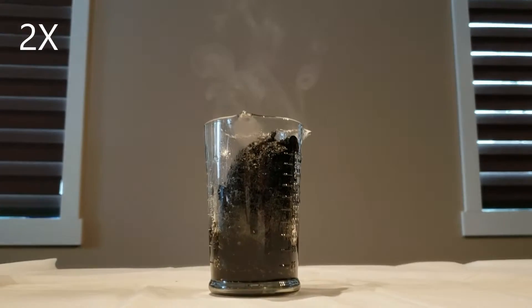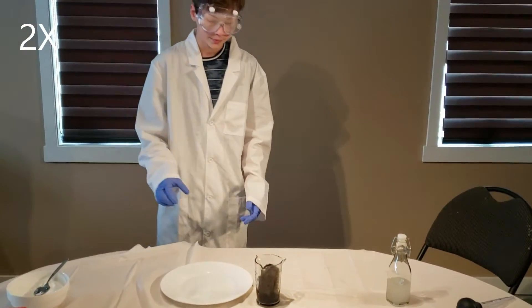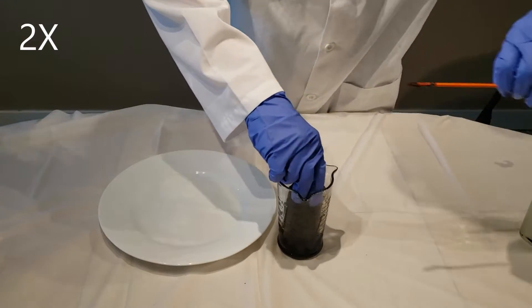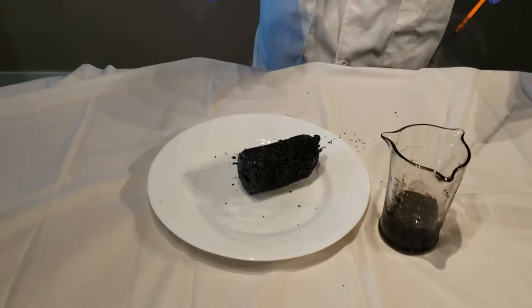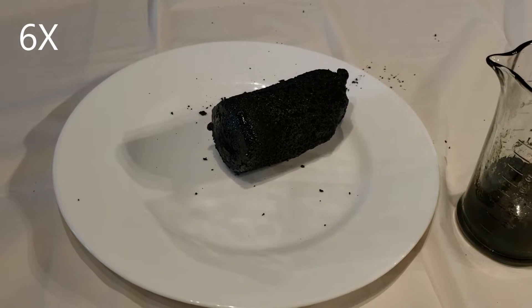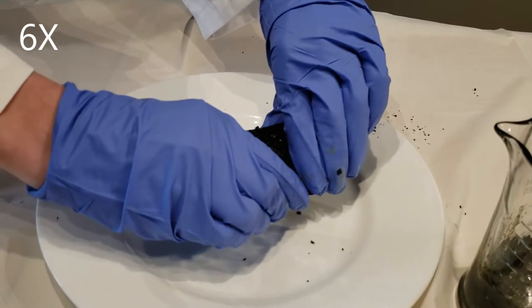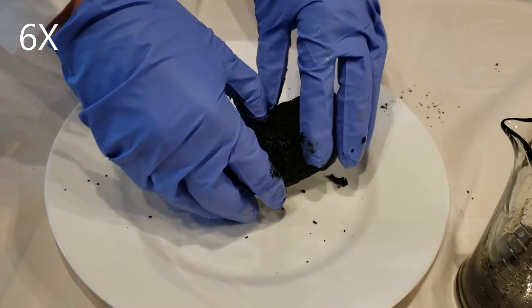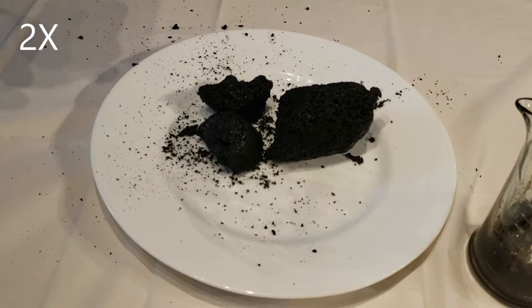I will also show you the texture of the sugar once I am done with it. This carbon snake, or whatever you call it, was very brittle and not very bendable.